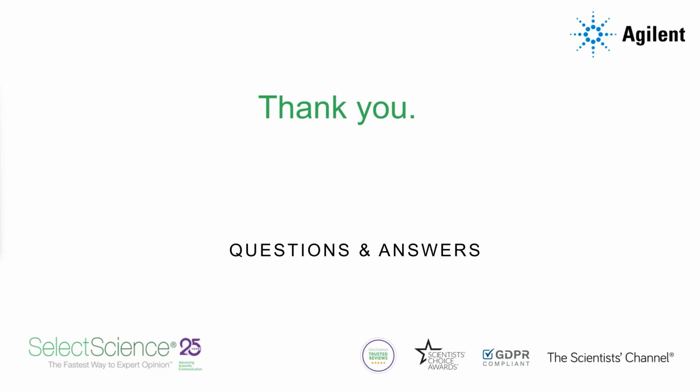Then I think our final question for the day is, how big is the Xdrop instrument? The instrument is a small instrument. It's around 30 centimeters tall and not much longer. I think it's about 40 centimeters long.